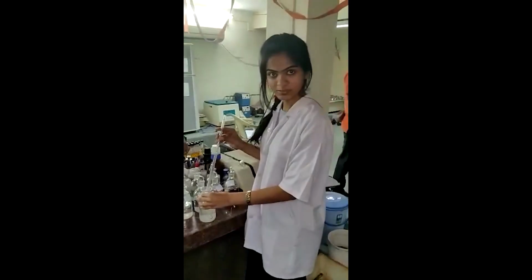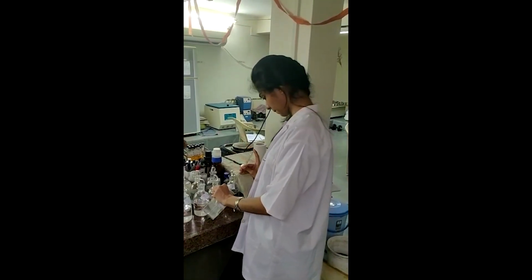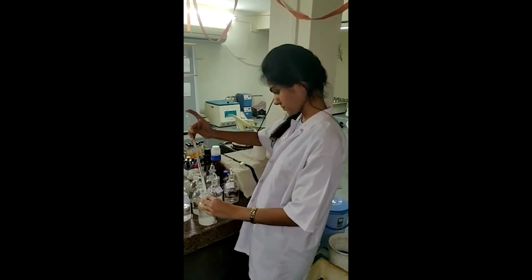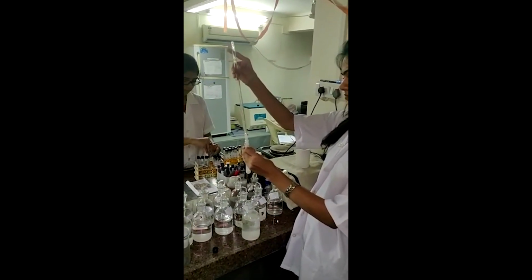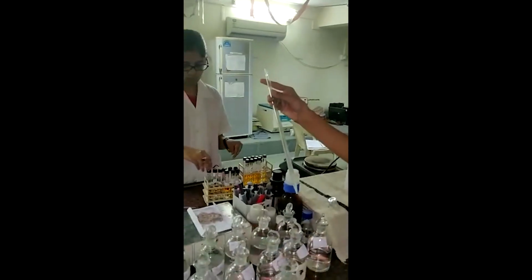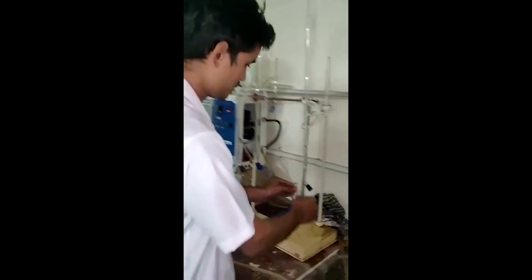For the COD experiment, we take 2.5 ml of sample. Now we are going to add 3.5 ml of sulfuric acid reagent.